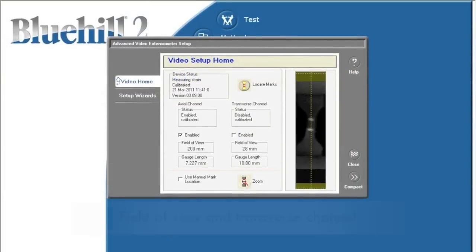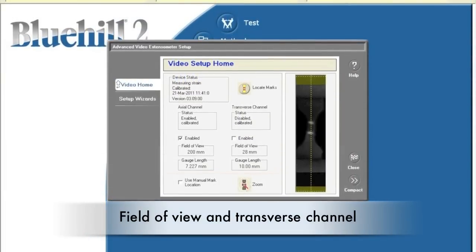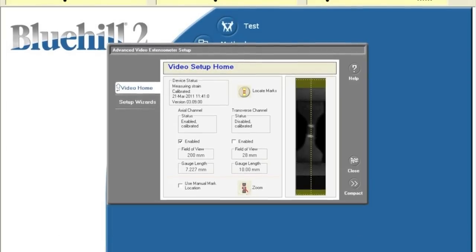The field of view is the length of the window and the maximum distance that the gauge length can be. The transverse channel monitors the horizontal distance and is usually not used.